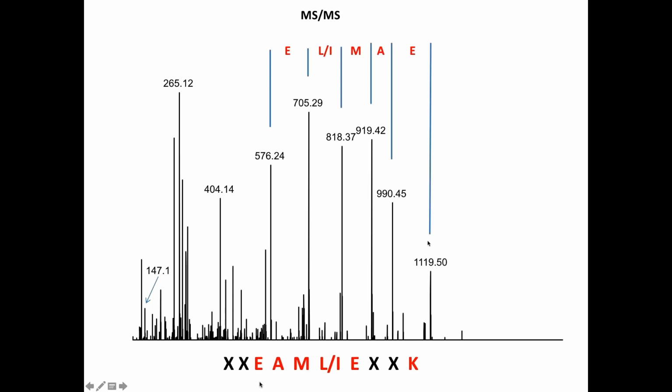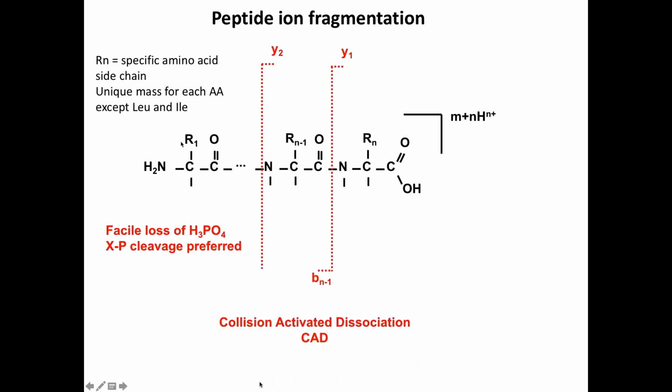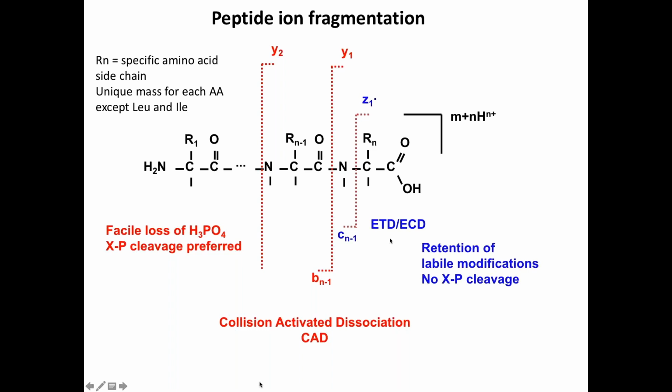And then, if you remember from your biochemistry course, the residual mass of every amino acid, you can just use a calculator and walk through this and say, oh yeah, this is a partial sequence. No one likes to do that anymore. I did that for my thesis in Don Hunt's lab, alongside John Yates, before he had developed Sequest. And there are rules for fragmentation, and it often depends on what type of mode you're using. I'm not going to go into any detail here, but just showing you that ETD, ECD, and collision activation do give you different fragments.